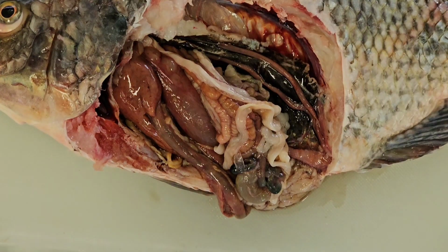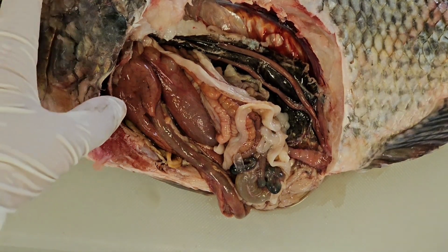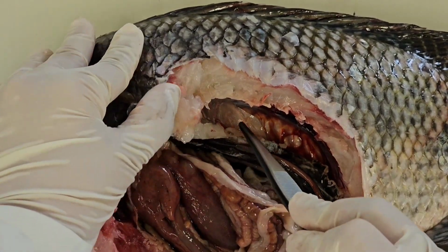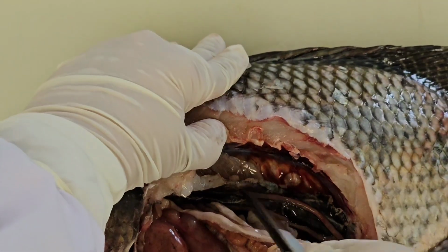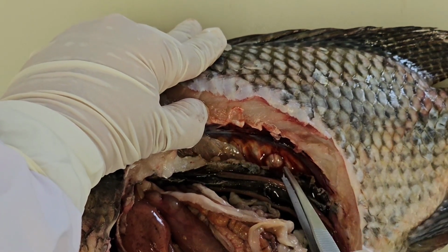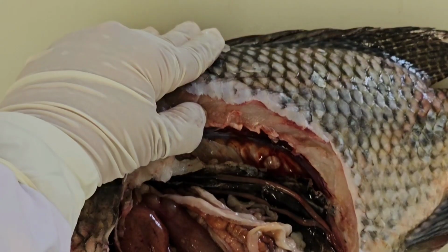I have cut the structure near the operculum and the structure near the dorsal part of the body. So at the dorsal part, you can see the structure of the swim bladder clearly. And at the dorsal part here, inside you can see the structure of the kidney. It is located in the cavity that the swim bladder is located in. So this one is part of the kidney there.